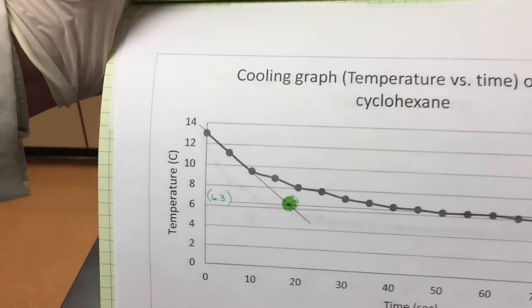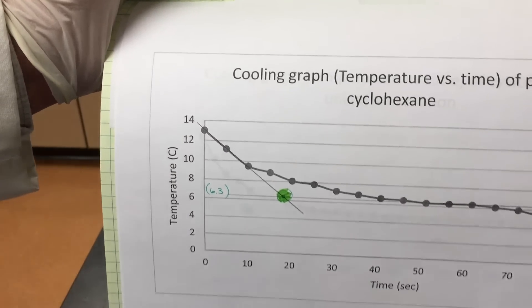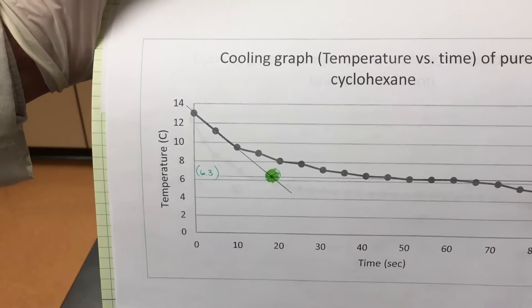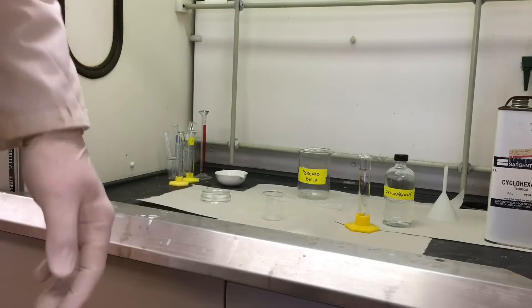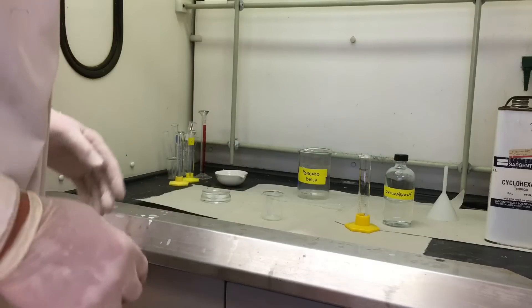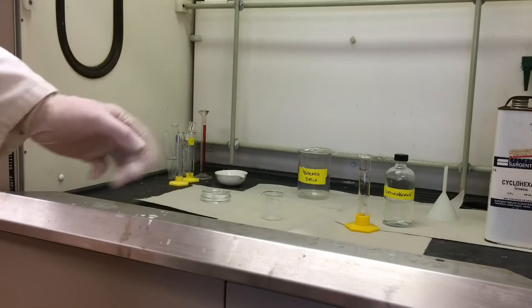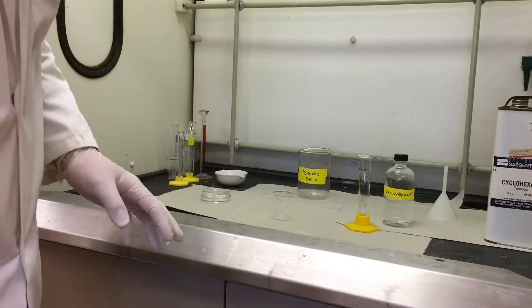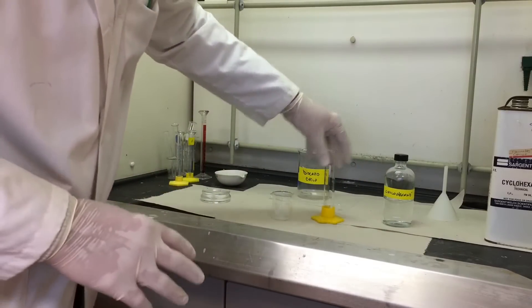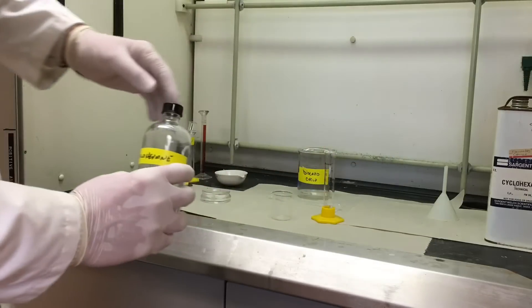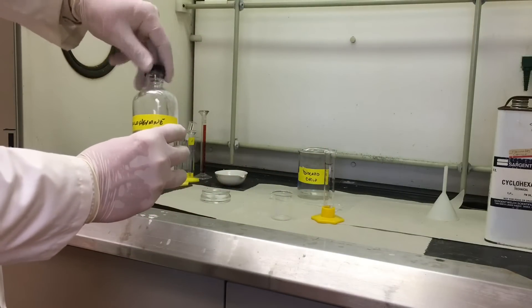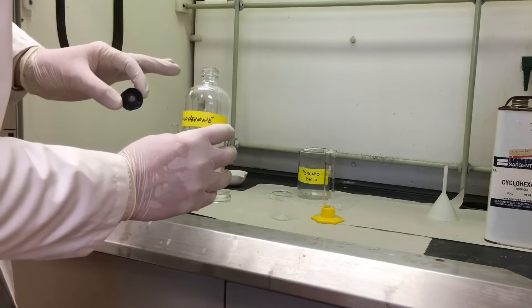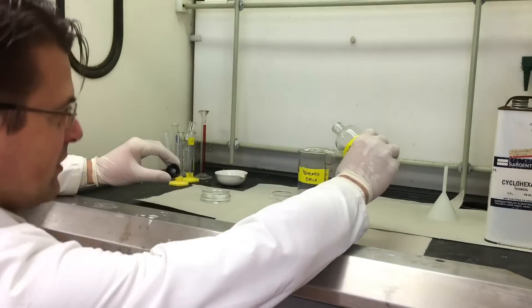Now that we have the freezing point, it's time to repeat the experiment, but this time with the unknown. For the second part of the experiment, we're gonna need a very precise amount of cyclohexane and also a very precise amount of the unknown. First we'll just pour 20 milliliters of cyclohexane and then we're gonna measure the mass of that.